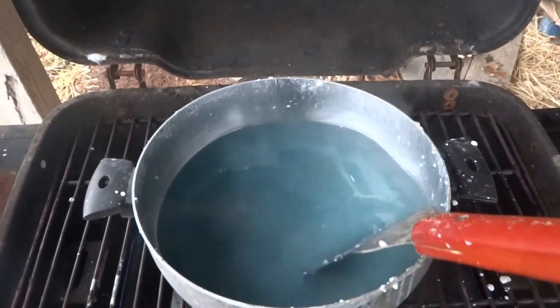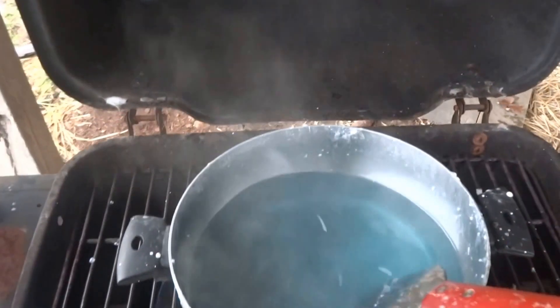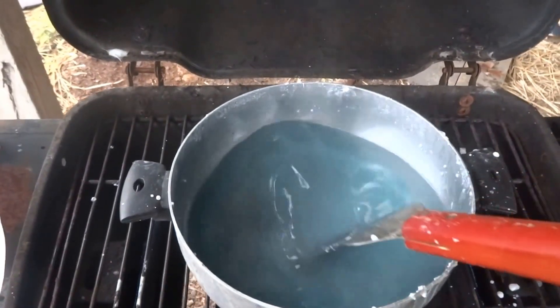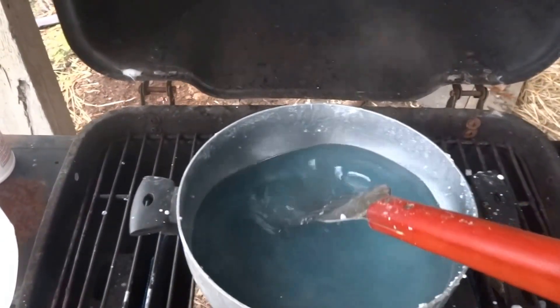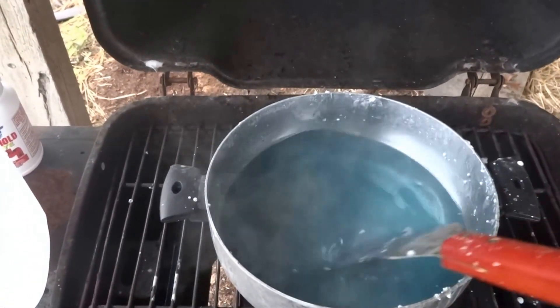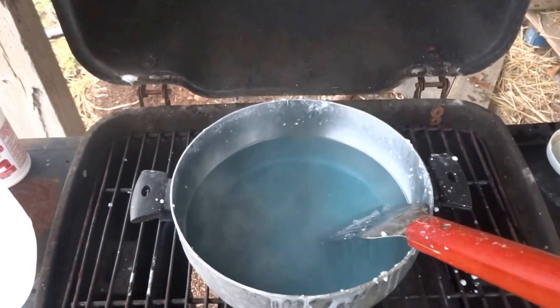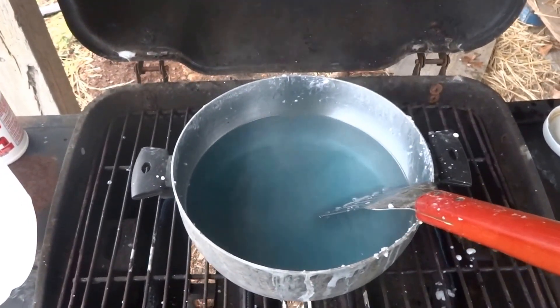There are other videos on making sodium silicate and they go further in depth. This is a little bit harder way than working in a lab with a Bunsen burner or with Pyrex, so this takes longer and involves a lot more manual labor as far as stirring. It's so much easier doing it in a lab with a vent hood.